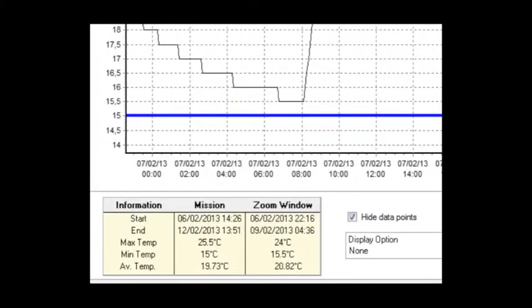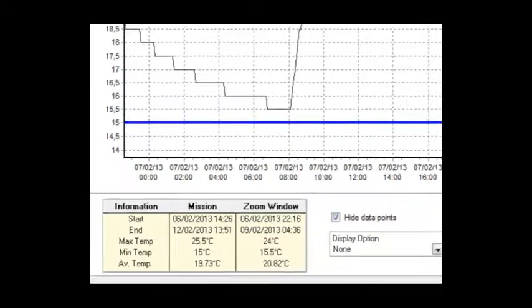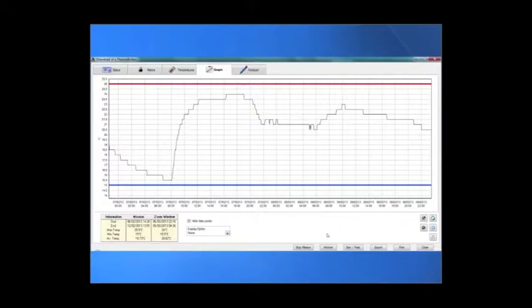ThermoTrak PC calculates the minimum, maximum and the average value for the whole mission and of the period of the zoom.